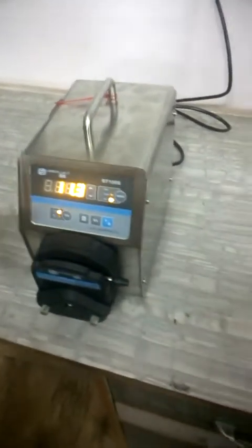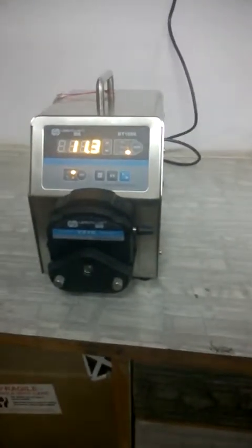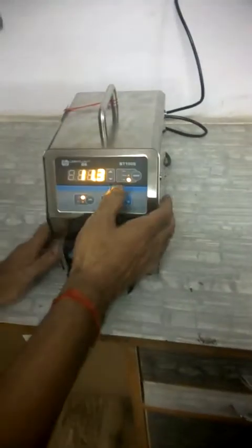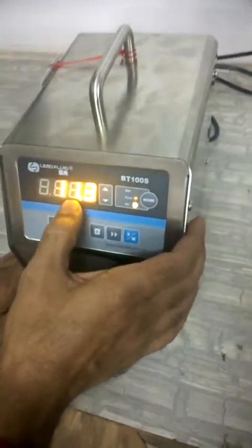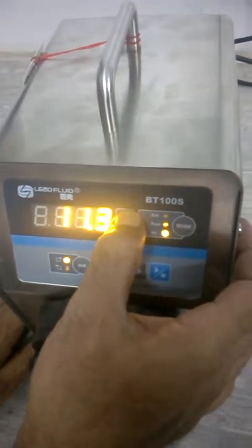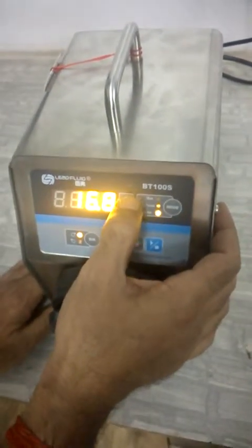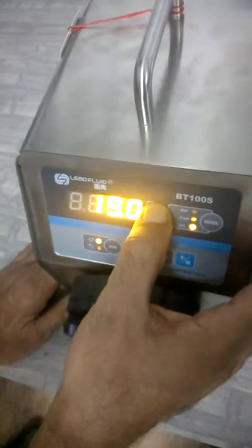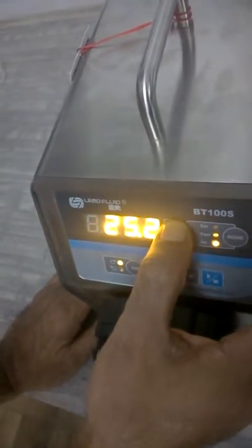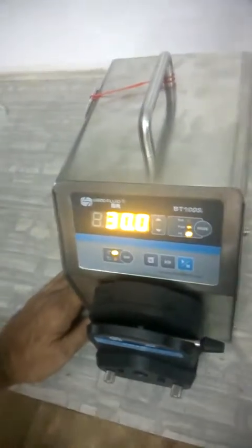These flow rates are achieved with different tubing — if the tubing inner diameter is larger, the flow will be greater. Currently the pump is at 11.3 RPM and can go up to 150 RPM. Using the up and down arrow keys we can increase or decrease the RPM. I am setting it at 30 RPM.